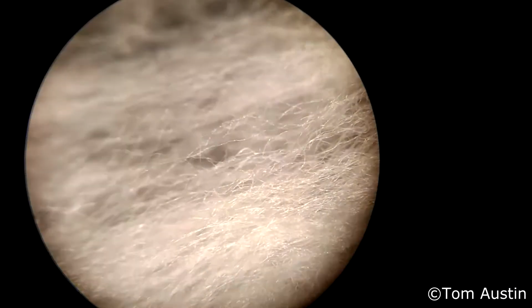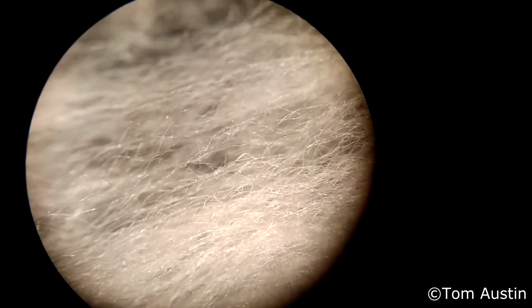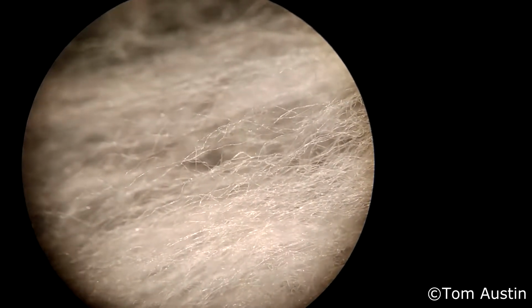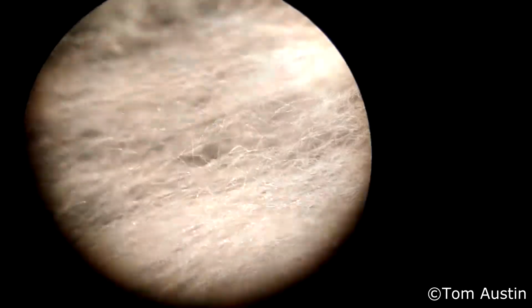Here we are, the meat of the deal. These are the individual fibers. You notice how they're sort of helically arranged? They just sort of spiral. And they've got a bit of a roughness to them. That's exactly what we want to see. You want very fine fibers with a very slight spiral to them and a roughness to their texture. That allows them to adhere together and make very strong thread.